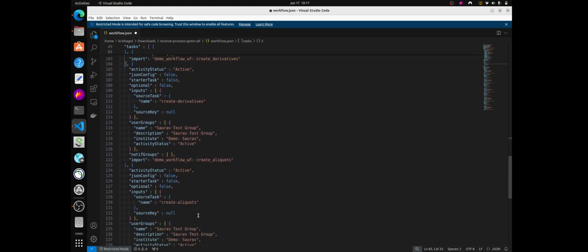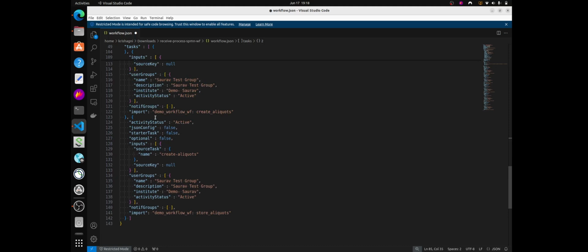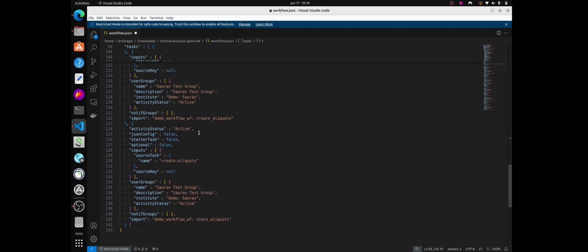And then we have create aliquot. Where is it?